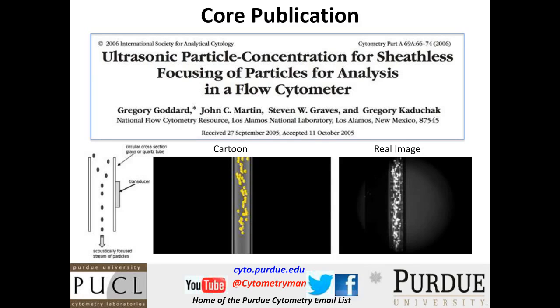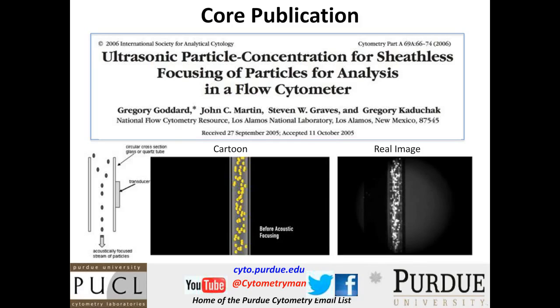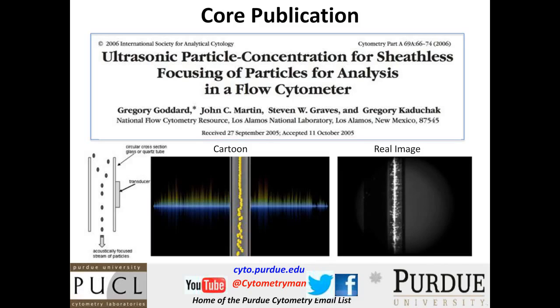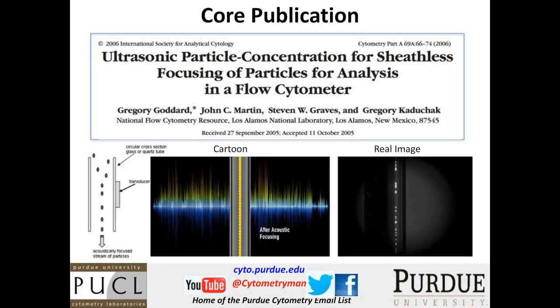So I'll show you, first of all, there we have as the system starts, and this is before acoustic focusing is turned on. And now what we're going to do is turn on the acoustic focusing. So turn it on just a little bit, and you see the cells starting to move to the center. We turn it on a little bit more, and the cells are further in the center, and you can see over here on this side that they're really starting to align quite nicely.